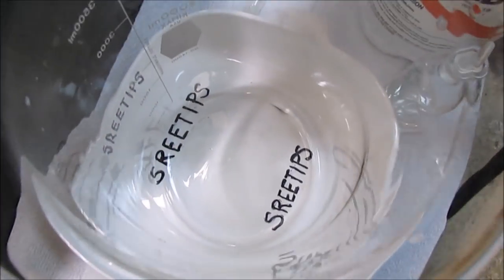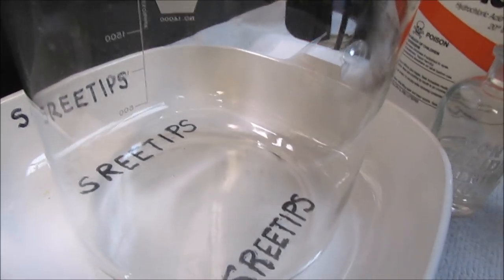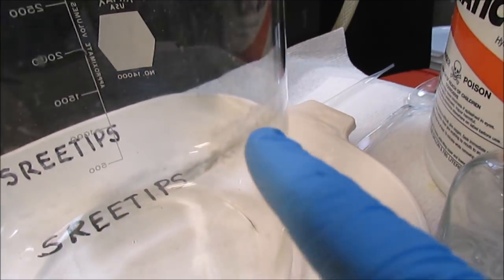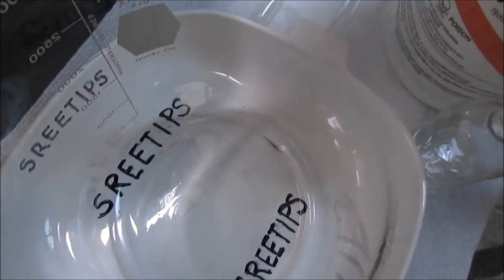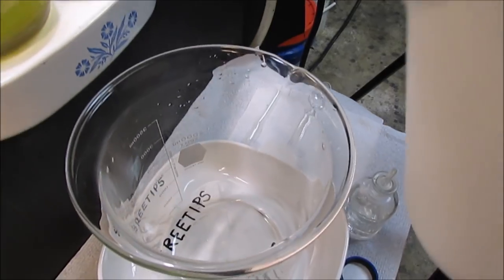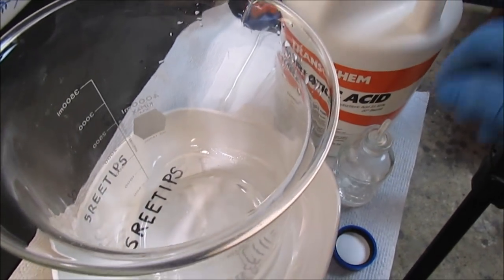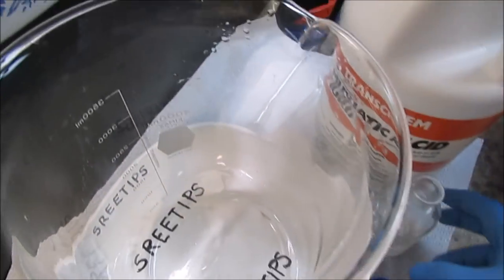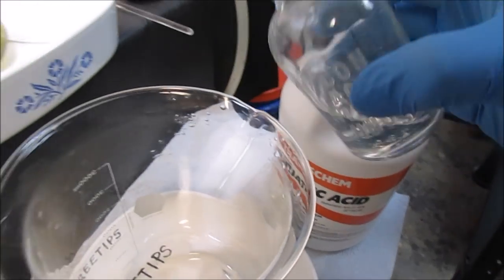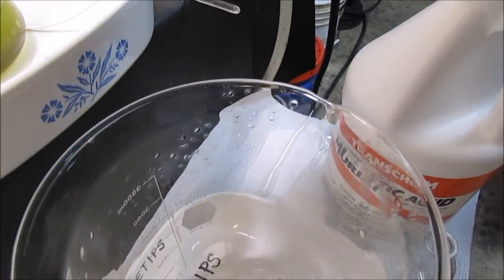This is the big beaker that the gold was in, and you can see I think there's some little bits of gold left on the rim here, and there's some down in the bottom. You can never get all that out of there, so what I usually do in that case is just add a little hydrochloric acid, and then followed by a few drops of concentrated nitric acid, and then I just put the lid on it.